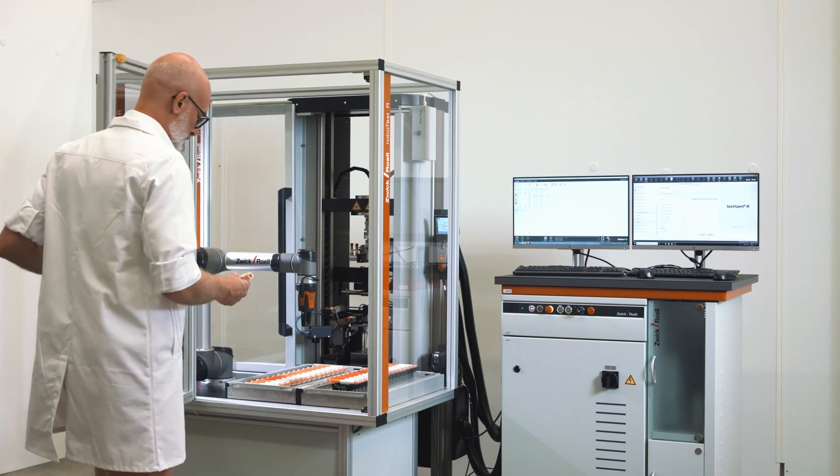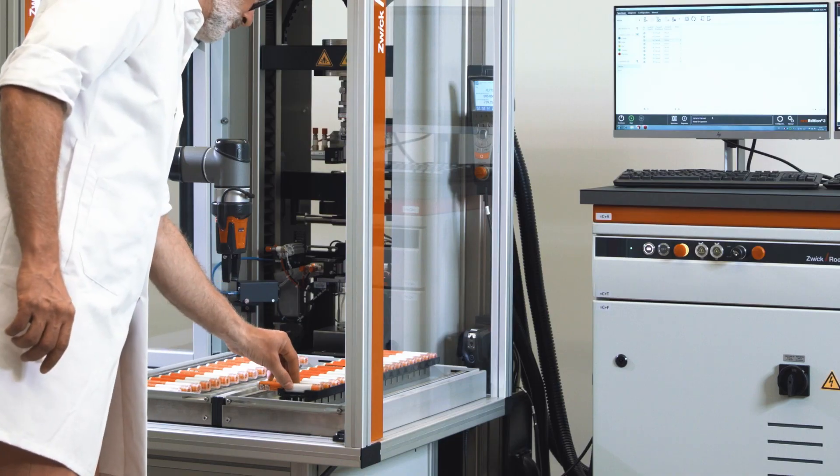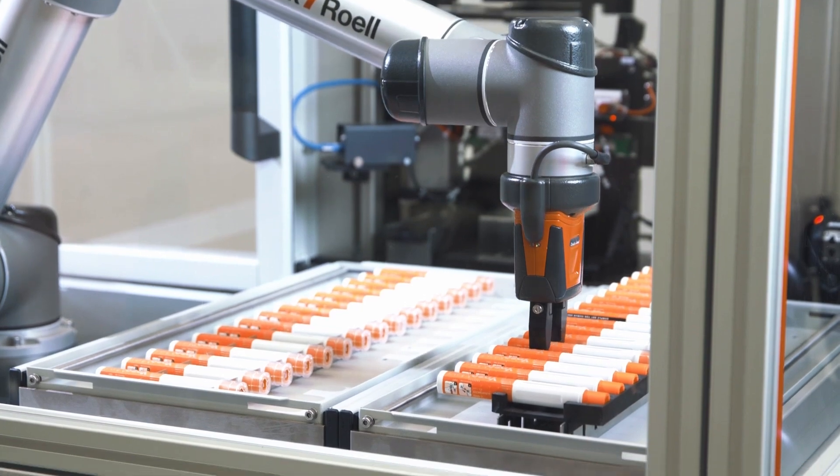With an ever-increasing demand for testing, more people are looking to Zwick Roell for automated testing solutions.